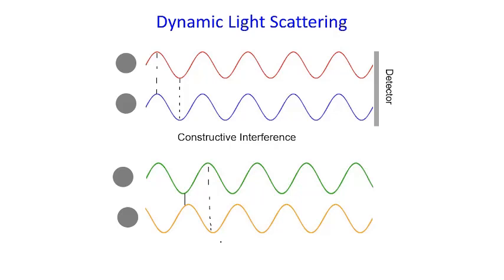Okay, so in this case these two waves will cancel out each other, since, as I said, the negative is coinciding with the positive, and therefore the intensity which is received at the detector will be zero. And this kind of interference is therefore known as destructive interference, right?